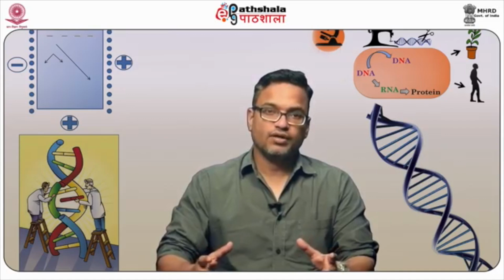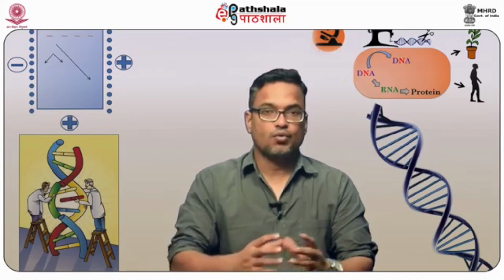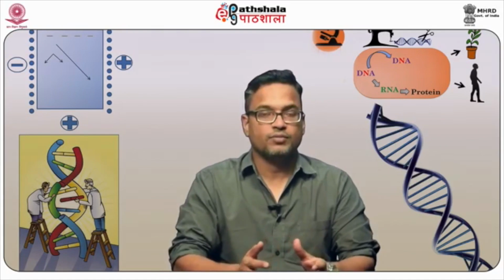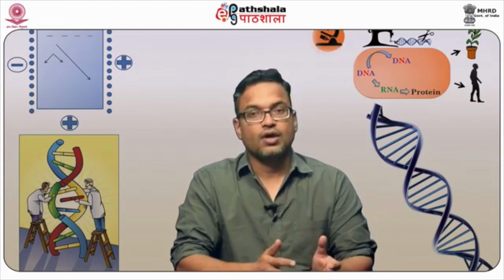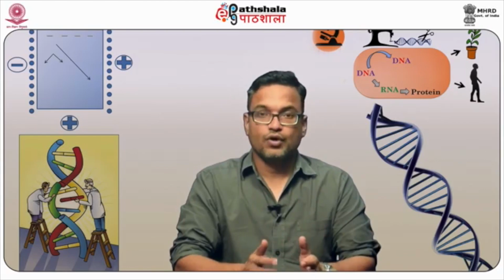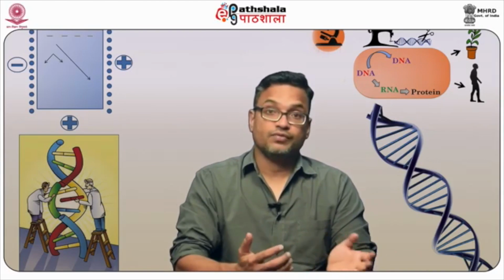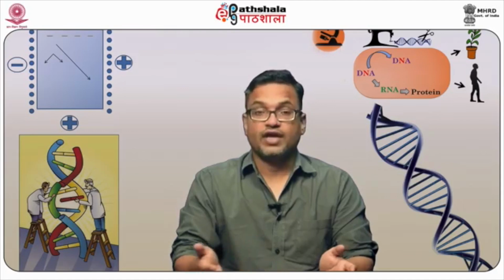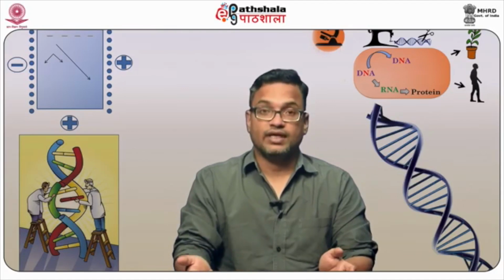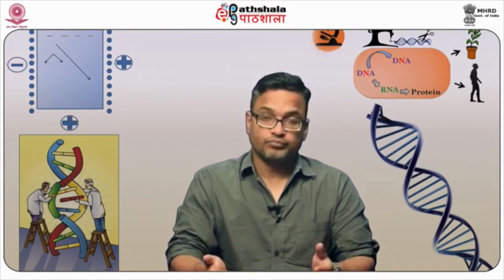The basic components of a microscope, however, remain the same. It requires a very high quality objective lens, so that we have minimal aberration, whether chromatic or spherical aberration. Also, the source of illumination has changed: once we had natural light, then the arc lamp, and now we have high quality LED light sources that are used to illuminate our fluorescent tag.